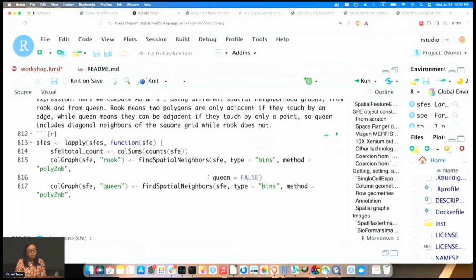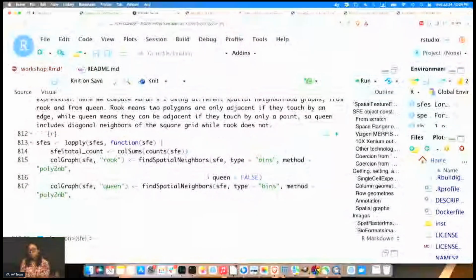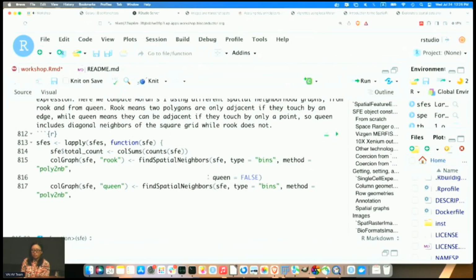Quick question. Oh, I think this was from a little bit ago, but when you were talking about the aggregation, Vineeth wanted to know if you're aggregating multiple Xenium samples. Actually, that can still work. Here's a subset of it. It's the same for the full thing.